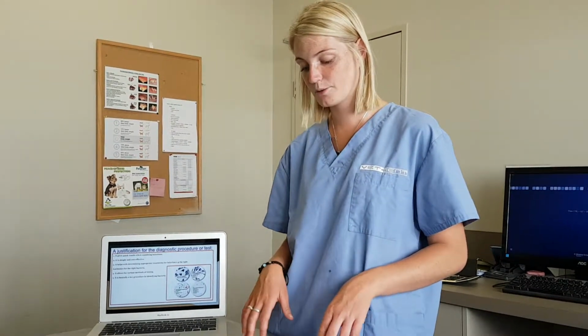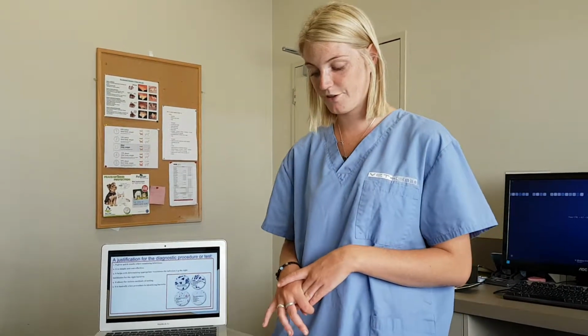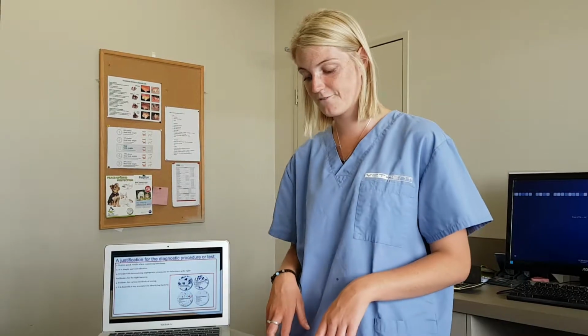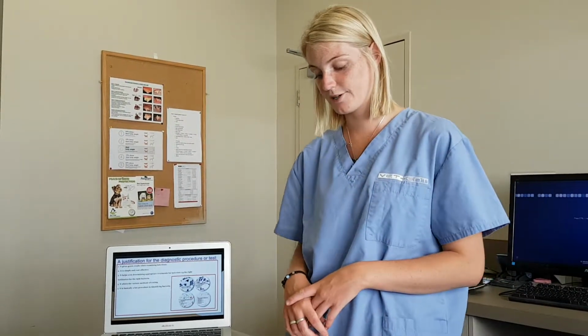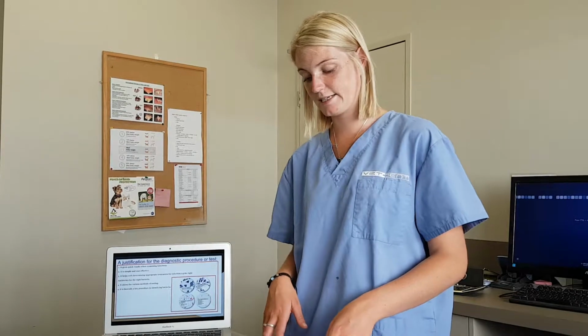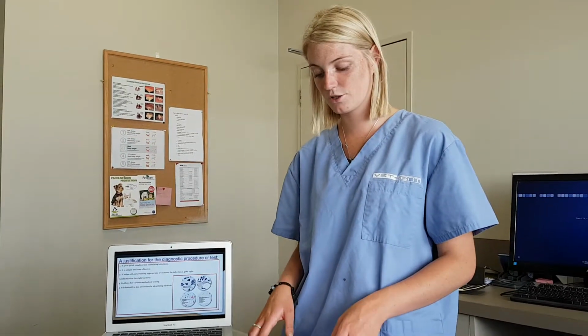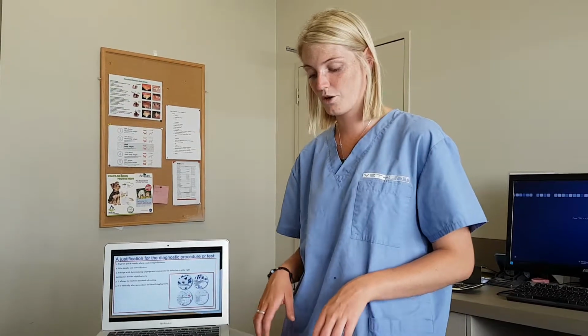Next we have, it helps with determining appropriate treatments for infections. It would not be clear whether an infection is caused by bacteria, fungi or viruses, and these kinds of infections would be treated in different ways. Now with a gram stain, vets can determine whether a certain type of bacteria is causing the infection and what type of microorganism is present.